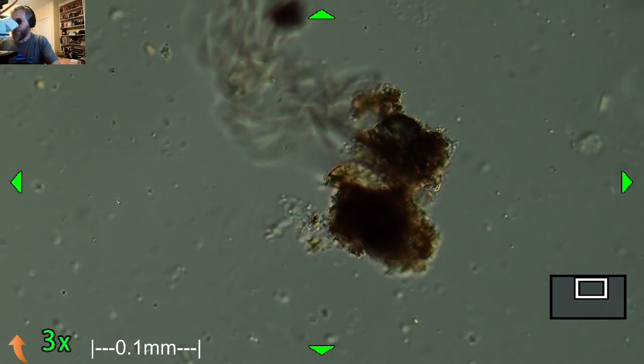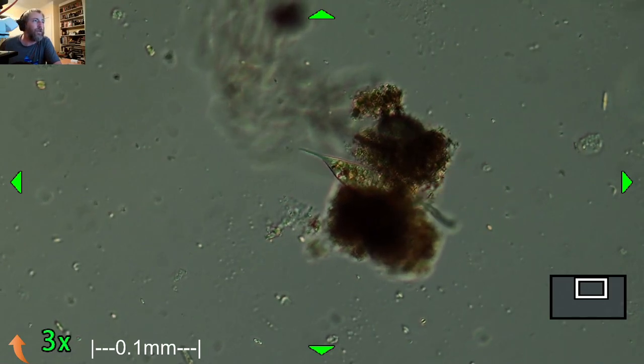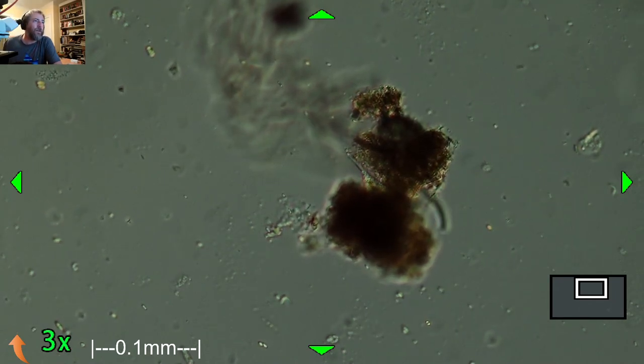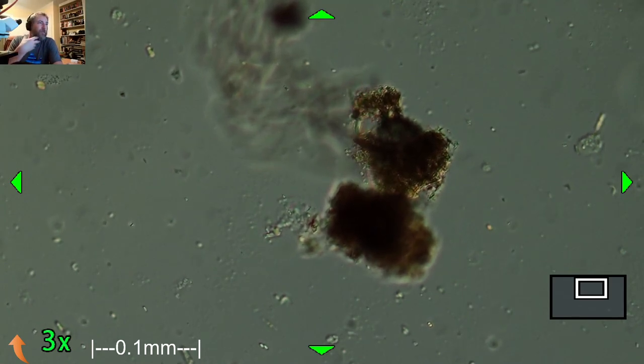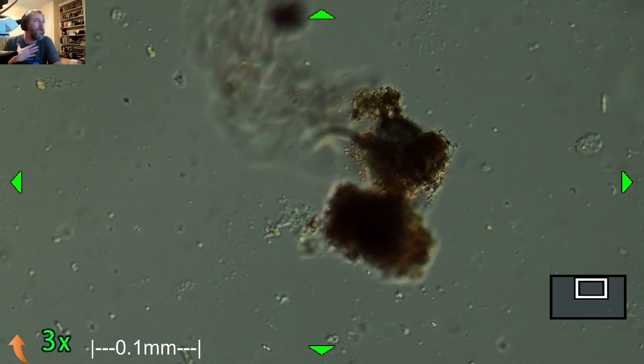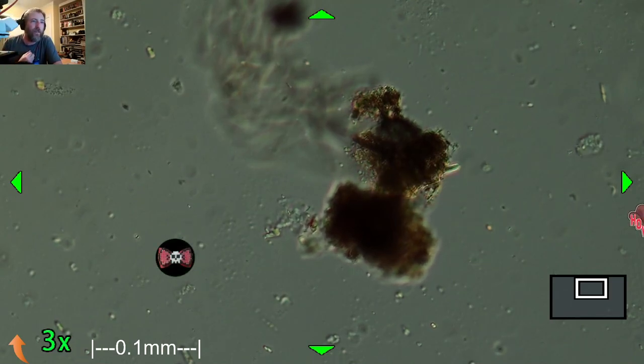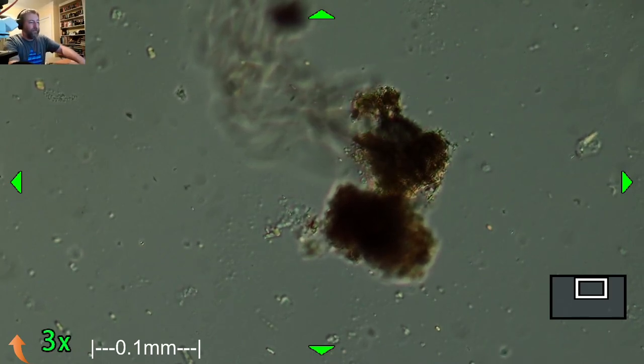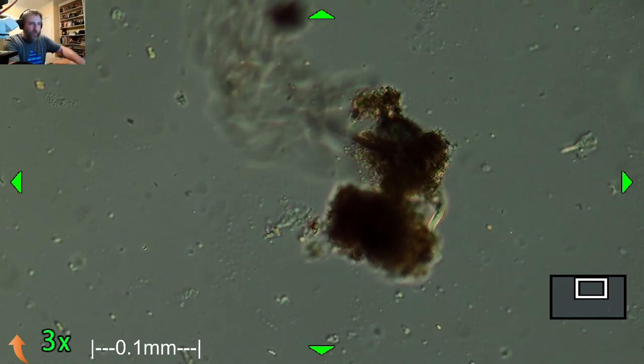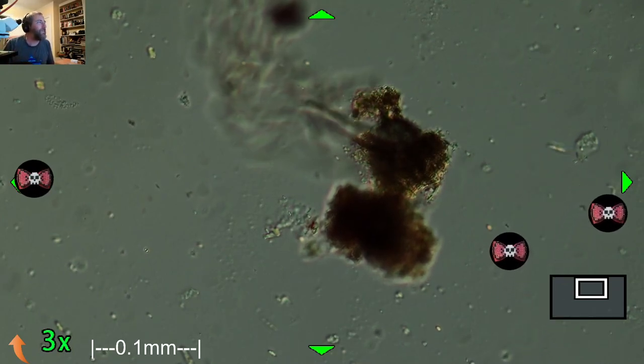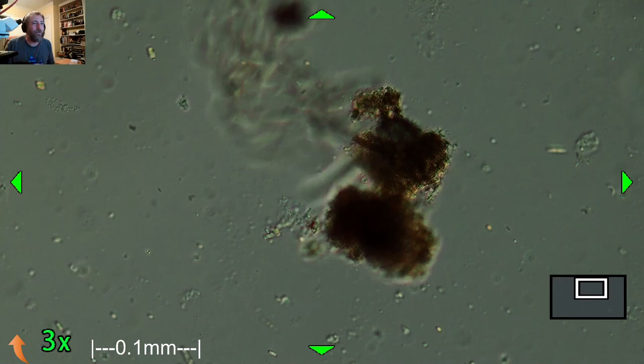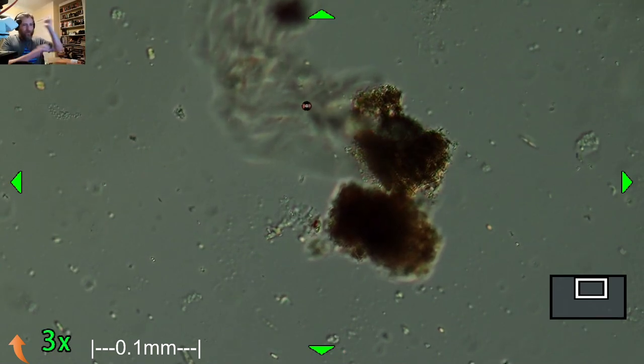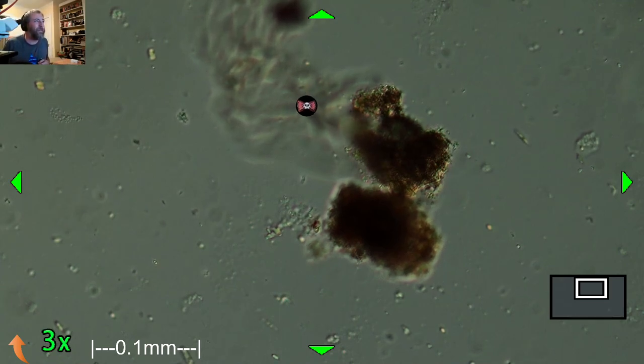So that's like Dileptus. It's a little ciliate. And we've seen them eat before on the stream. And the part that's wiggling around is sort of, think of it like an elephant's trunk. And it's right over top of the actual like mouth hole, which they can kind of expand open and stuff things in. Hey, Devil and Mrs. J, did you see that? I want to show you this. I did something really cool. I got these like little shout outs, right? MRSJ was yours, right? But look what happens. Anytime anybody says, I think it's Devil, is that right? Yeah. Anytime anybody says Devil, it pops up with a little emote I made of your artwork. You can see it's just searching around inside this old carcass.